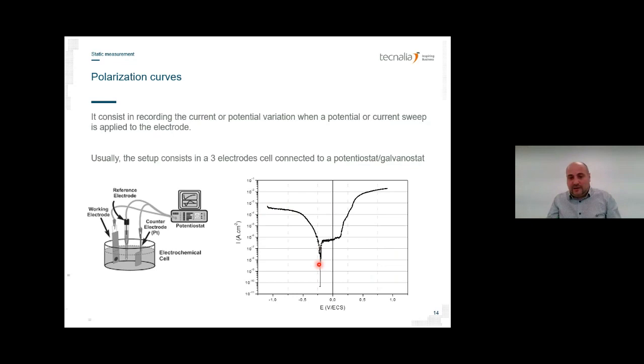Here this part, if we are in the linear scale, is going to be negative. And we are going to a very low value, pass zero, and go to the positive. And this shape, you see that in logarithmic value, changes completely. So what can we take out from that?